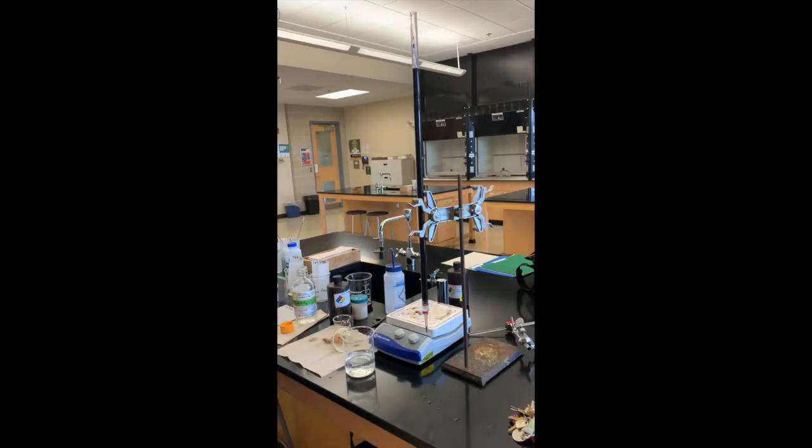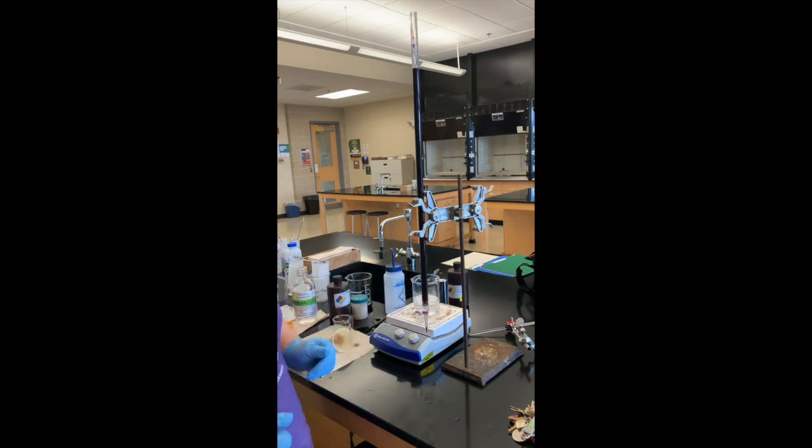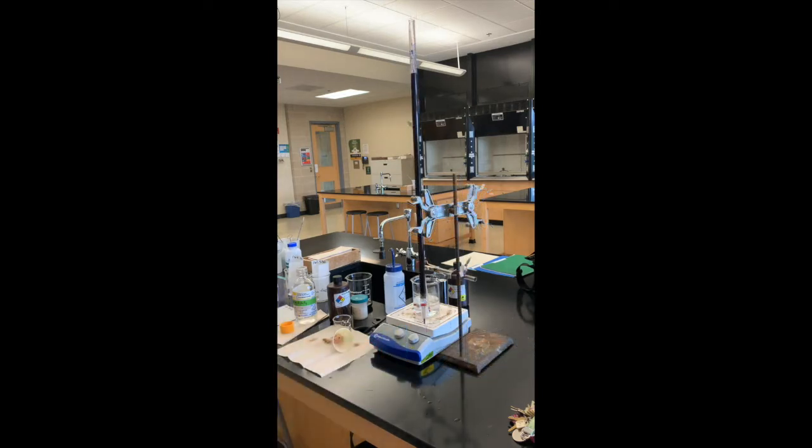We're going to be heating up during this titration. I'm going to put a stir bar into my first solution to titrate and we need to heat it to about 60 degrees Celsius. I'll put the stir bar in and place it on the stirring hot plate so this time we're going to stir and heat at the same time. Once it's at that temperature between 50 and 60 degrees Celsius we'll go ahead and start the titration.